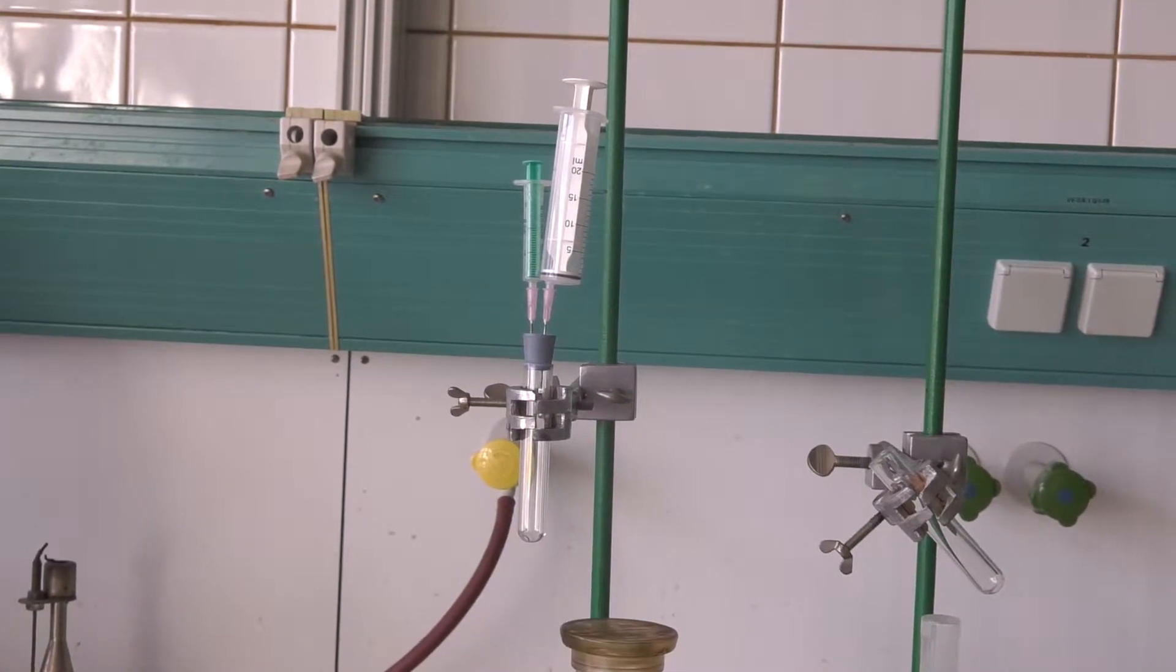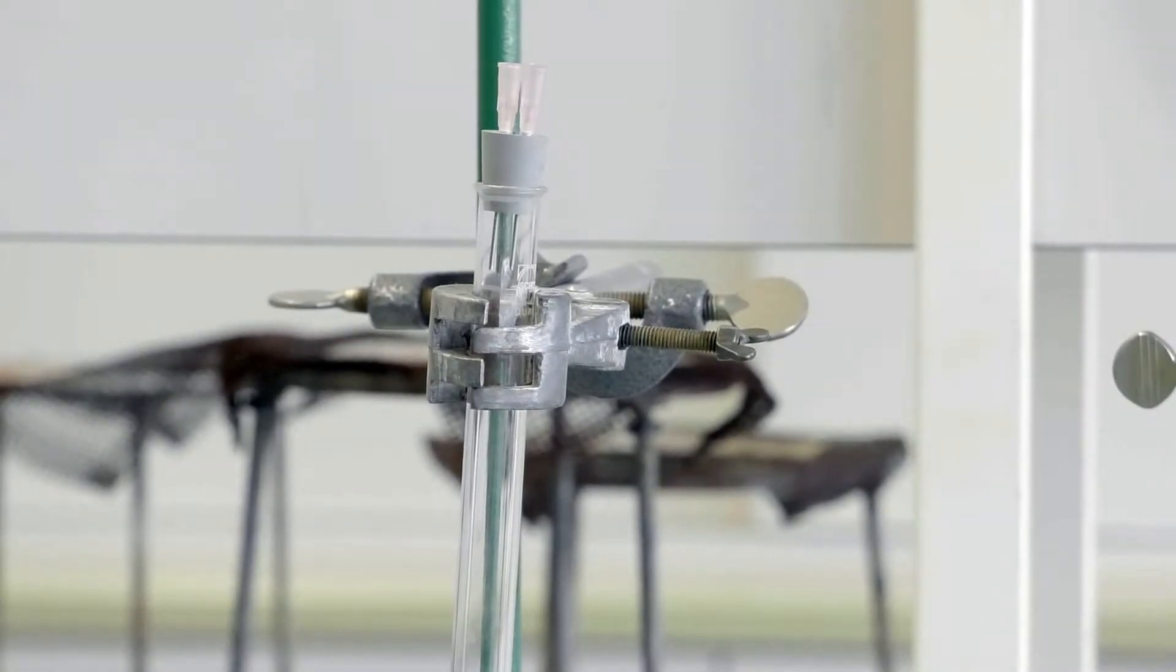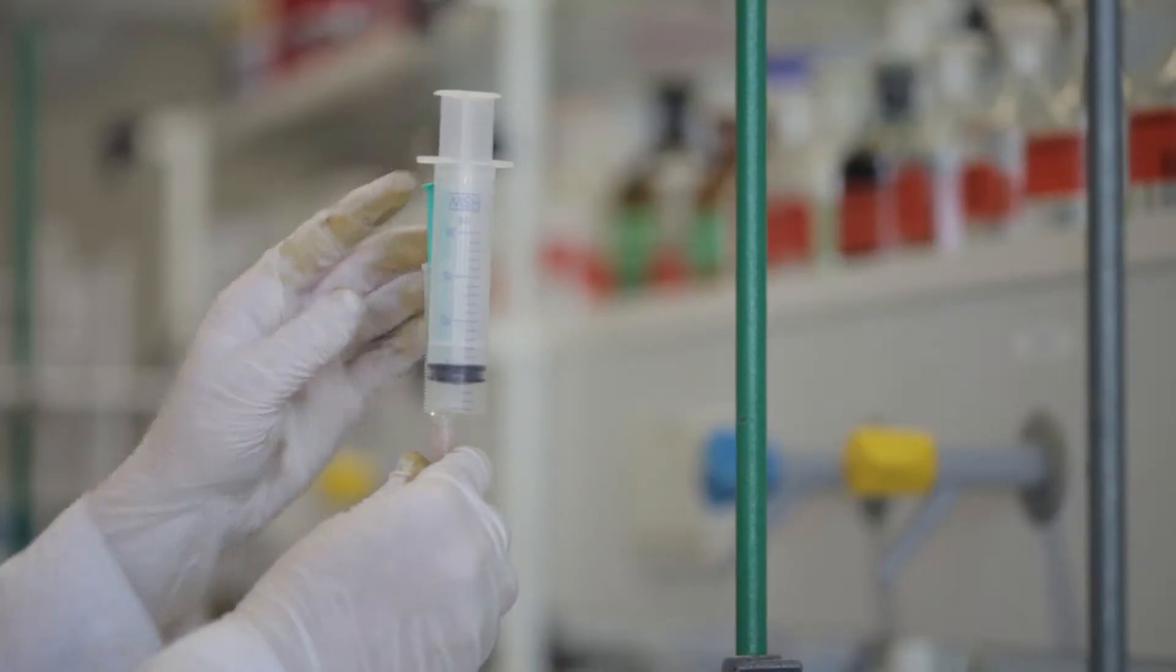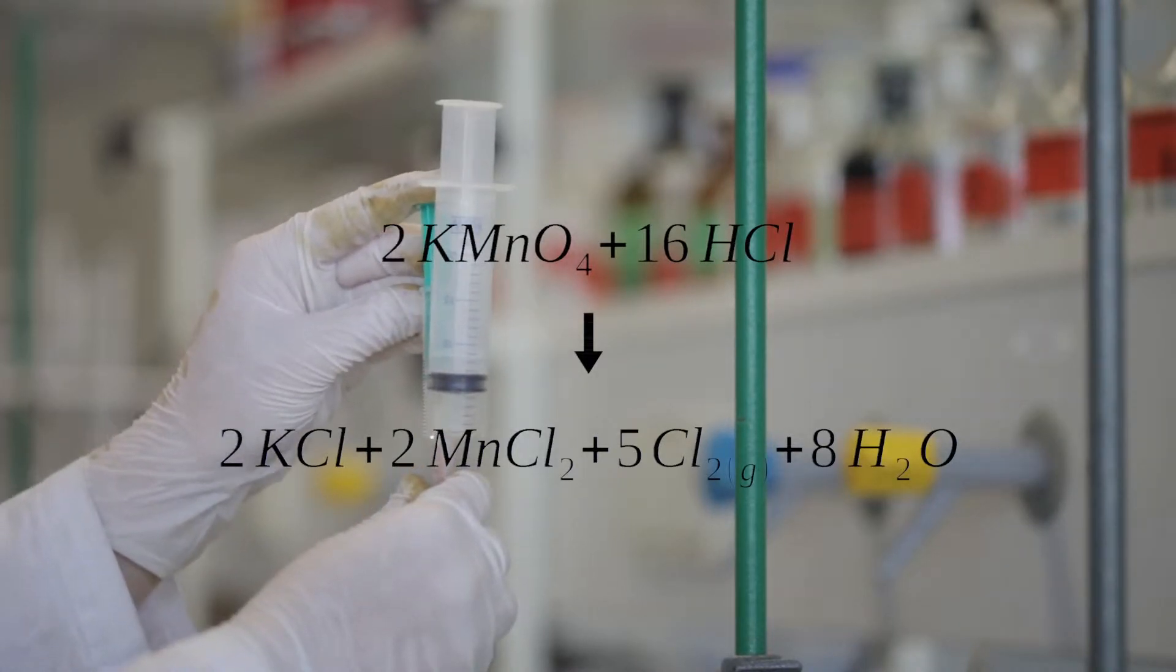One of the test tubes will be filled with potassium permanganate. Attached to the test tube is a plug with two cannulas. One of the cannulas includes concentrated hydrochloric acid.